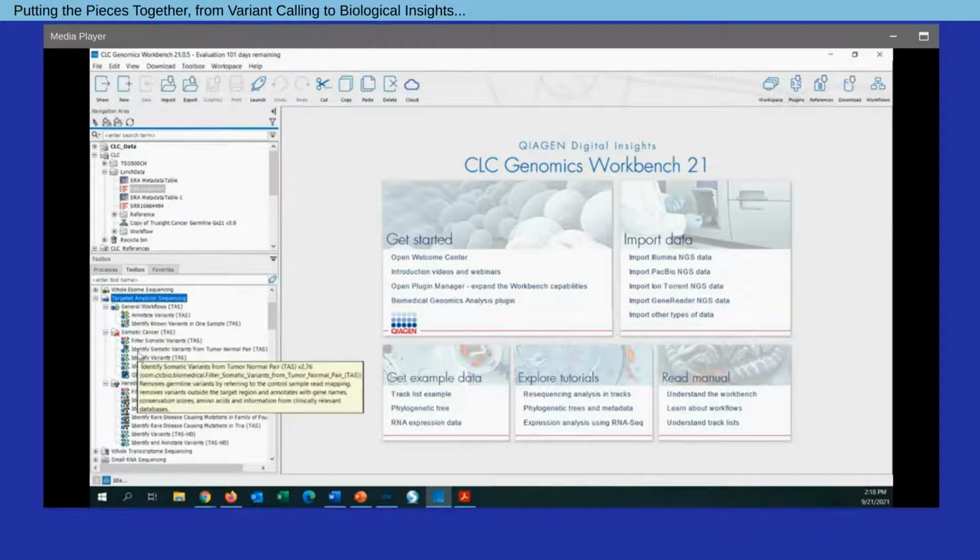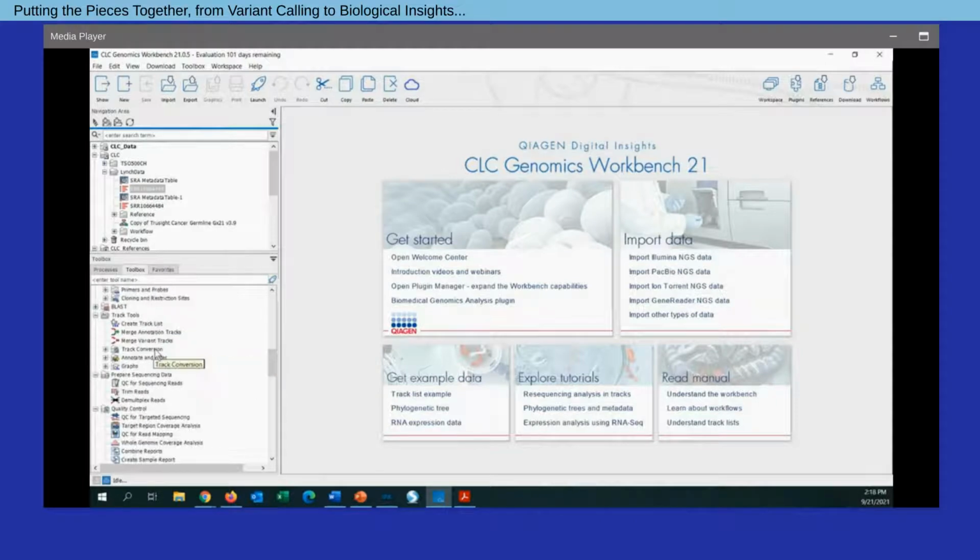So outside of this, again, we would have various tools in place for doing things like mapping reads to reference, variant detection, what have you. So really, you have the ability to utilize a workflow, process a sample in a standardized fashion very quickly, or do more exploratory analysis, process the data in a stepwise fashion using individualized tools.